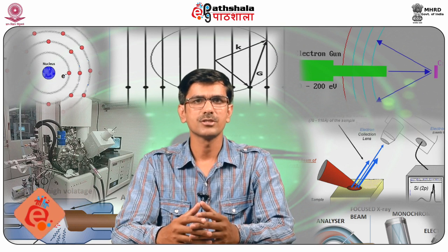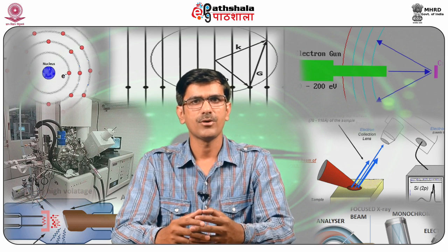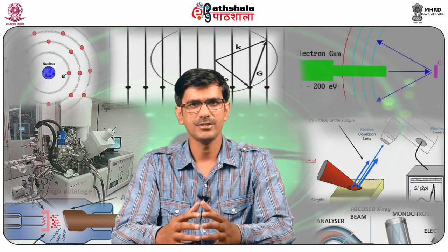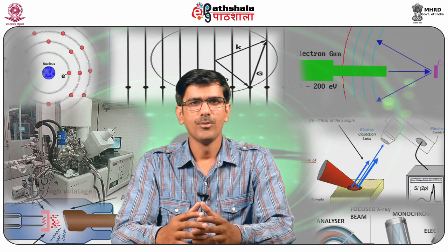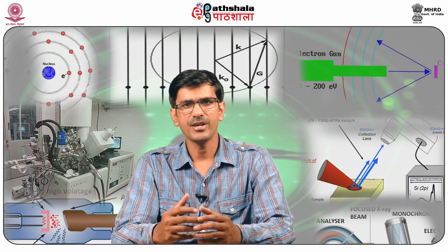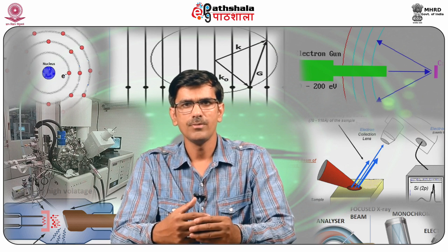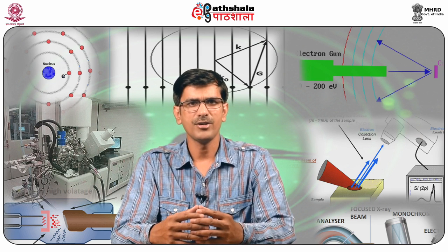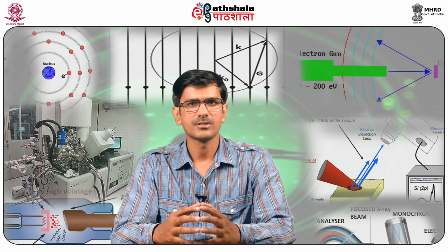Today, we are going to discuss the module Analysis of X-ray Diffraction Data under the paper of Surface Analytical Techniques 2. X-ray diffraction or XRD analysis is an analytical technique designed to provide more in-depth information about crystalline compounds, including identification and quantification of crystalline phases. This is a useful tool when we want to identify a contaminant or corrosion product, or for identification of foreign phases for purity analysis of crystalline powders.